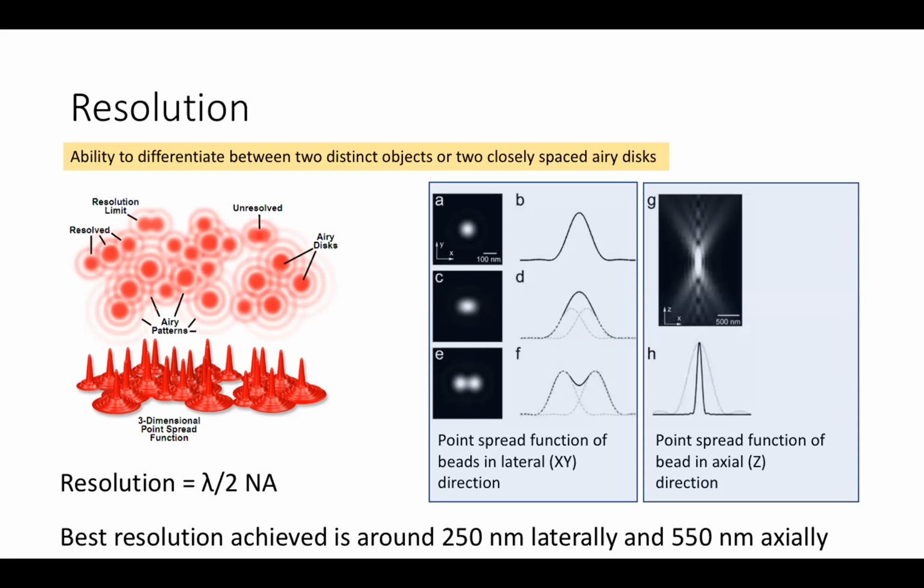However, when we look at the same object in Z direction, we see an elongated structure, and that's because of the property of the light and the physics and the optics. You will never get a flat or isotropic resolution with what we are doing. Okay, so this is something to remember, that when you image something in Z direction, you will always get this spread.